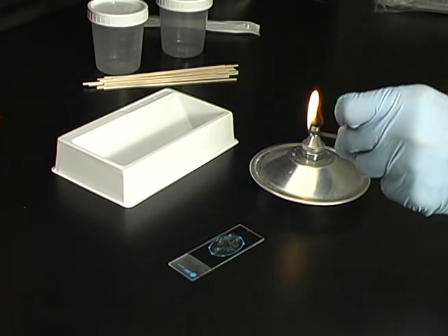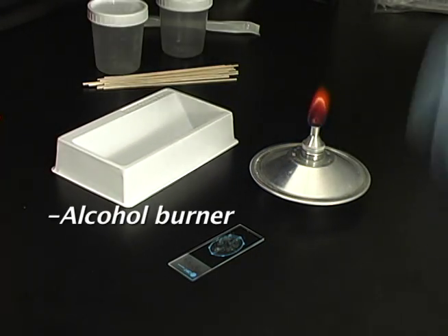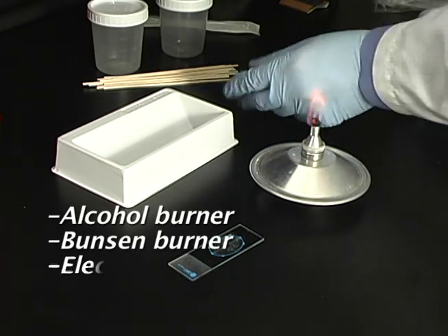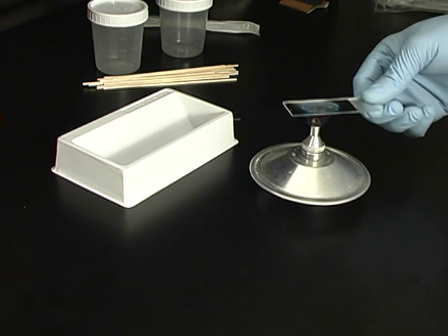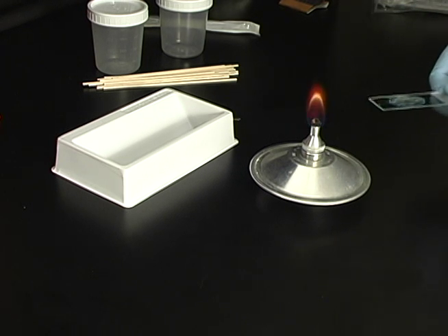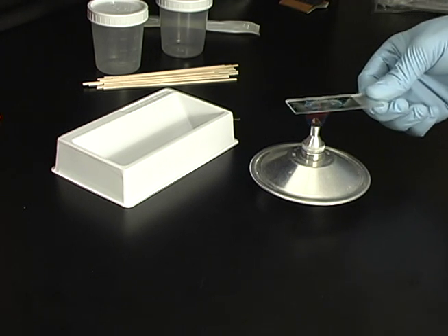Once the specimen has dried on the slide, heat fix the slide using an alcohol burner, Bunsen burner, or electrical heating block. If using a burner, pass the slide through the flame three to four times, being careful not to char the bottom of the slide.